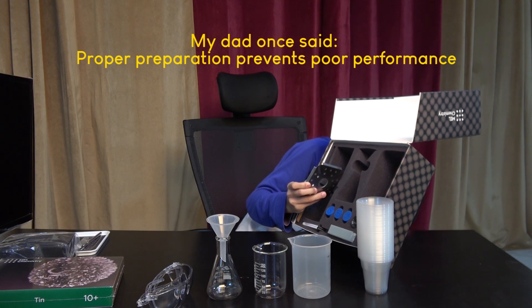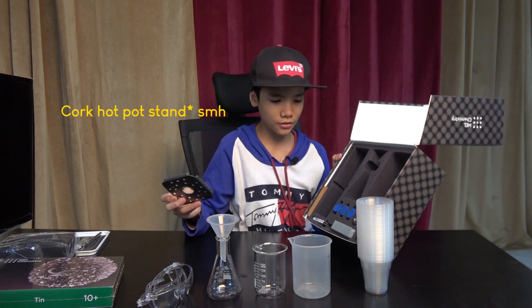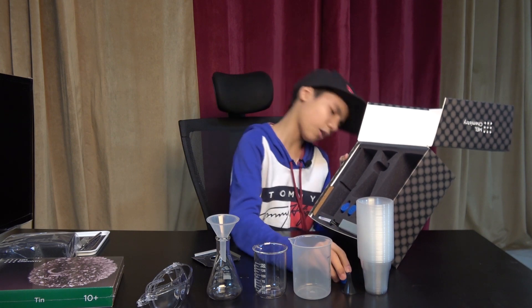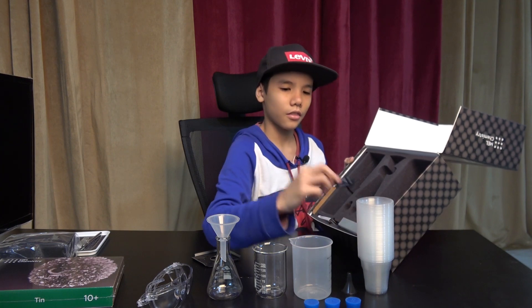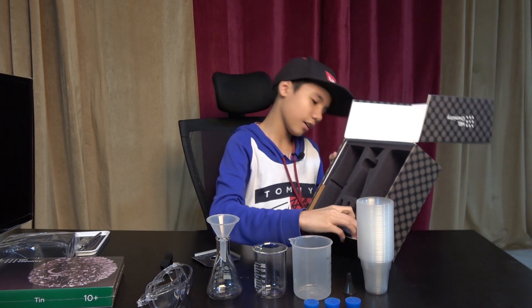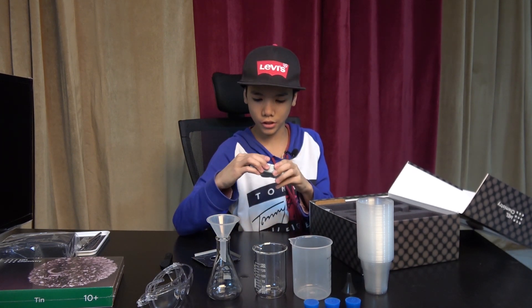This is the cork hot pot stand, and this is the small funnel. These are the three rubber stoppers, and this is the foam macro lens.